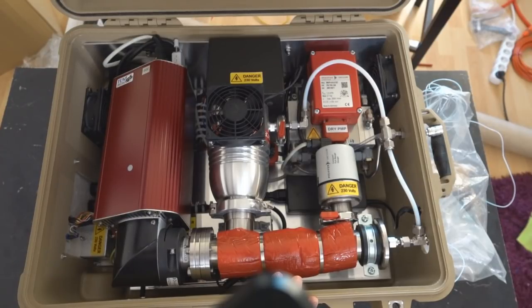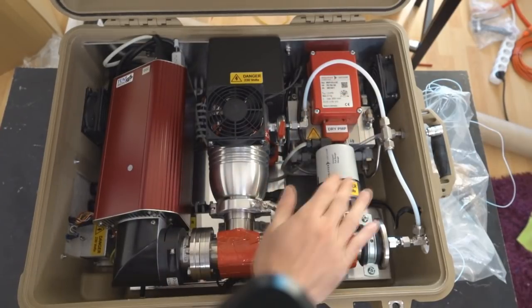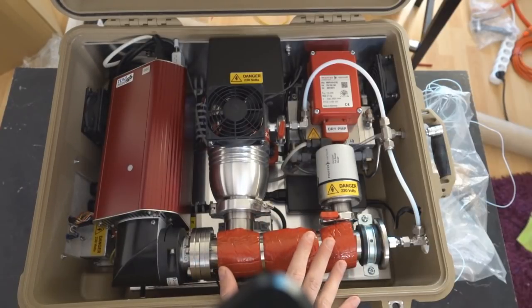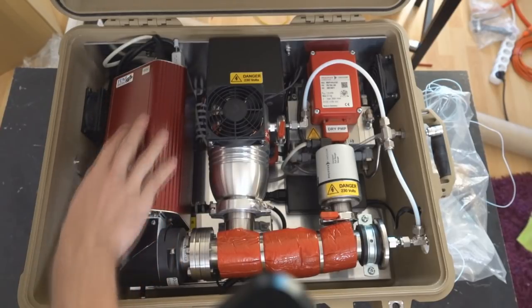In reality, it's a lot simpler than it looks. You've got two pumps here. This is a vacuum gauge. This is a mass spectrometer, this rather innocuous looking tube here, and this is the analyzer.